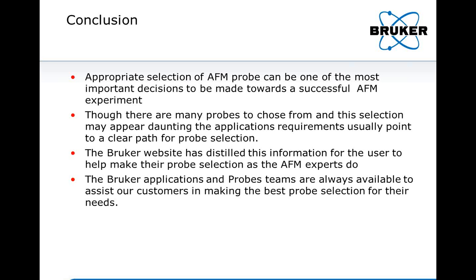So we actually had several questions in the live cell part about the different options in terms of different radius, and when you're talking about the blunt tips. So what radius of blunt tips are available? Generally, for Bruker probes, we have sharp and blunt, where the blunt is in the 20 nanometer end radius range. To get a larger radius, you need to switch to a spherical probe. For these, we sell tipless cantilevers, so you can build a probe that best suits your needs.